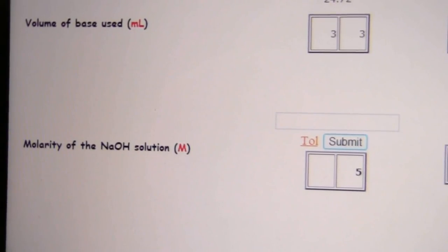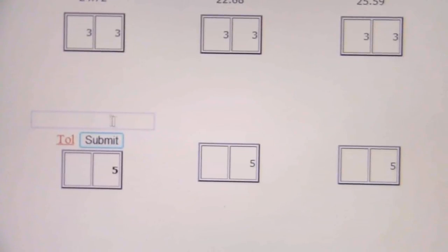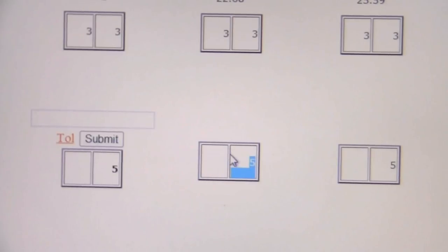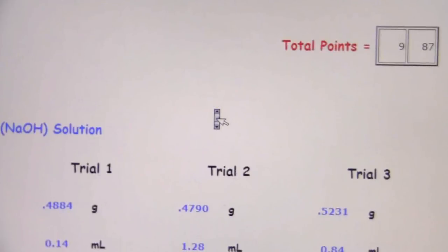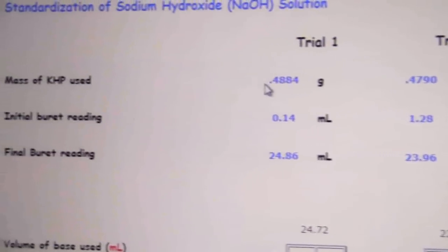All right, so now I've entered in the volumes and it is asking me for the molarity of the sodium hydroxide solution. Okay, so that's something that I need to calculate. The molarity I'm just going to pull up Excel here and the molarity I'm going to calculate based on my mass of KHP.